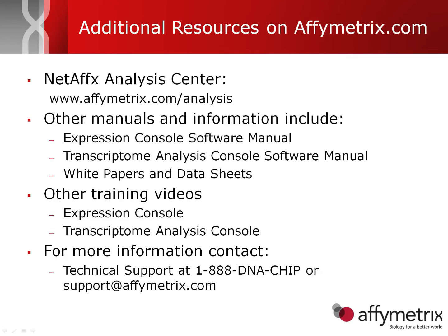So in short, that ends our demonstration of how to set up an analysis. As I said, it's a really simple process. You load your chip files in, define your conditions, and hit run.